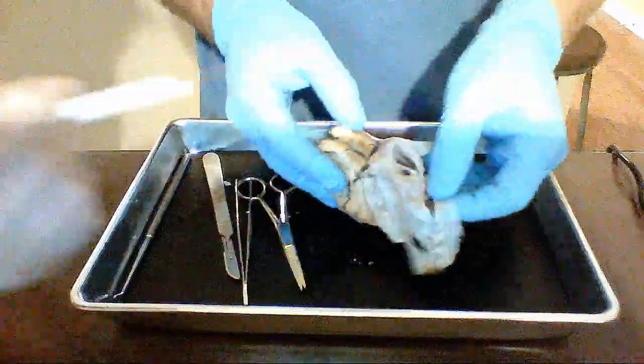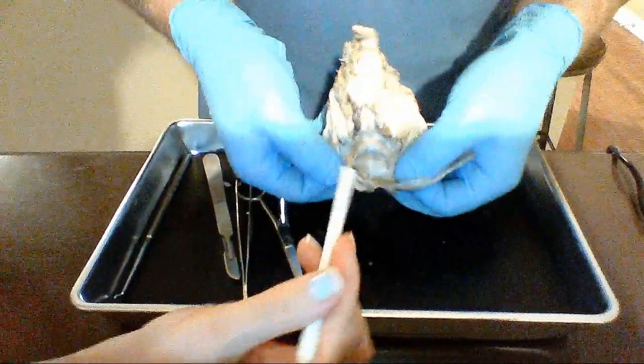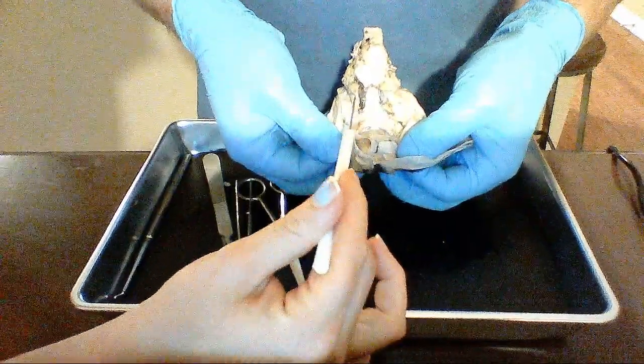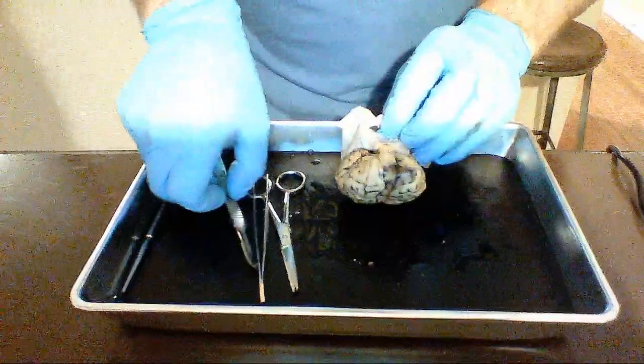And then as you go to the posterior side, you need to be careful. You've got your optic nerves coming down. You don't want to pull those off, as well as your mammillary bodies and your pituitary. You want to try your best here to separate the meninges from that under structure.